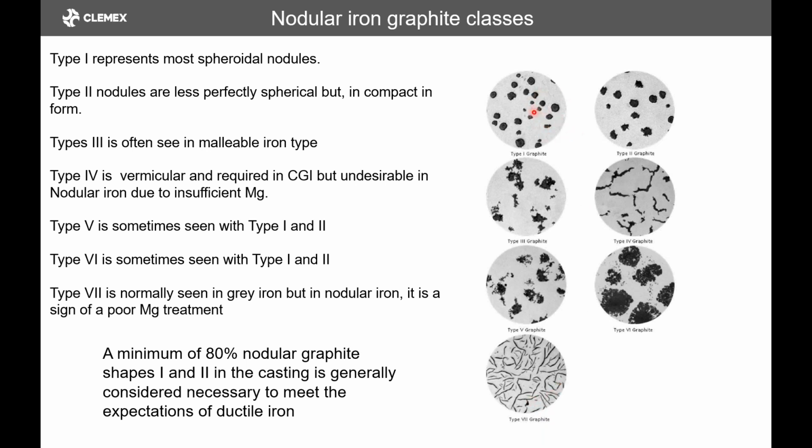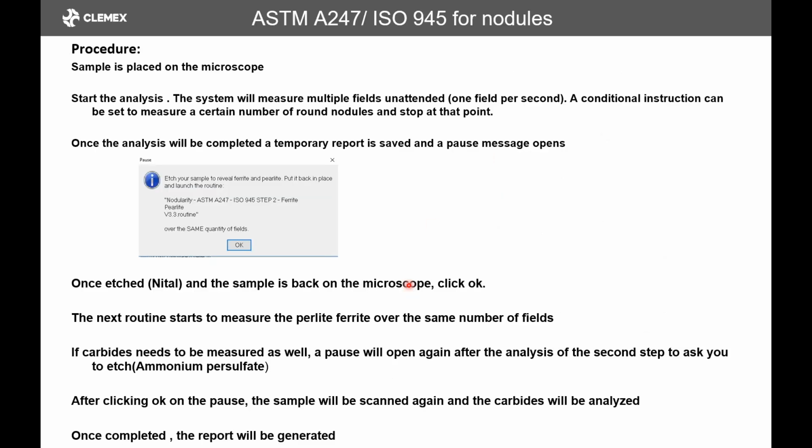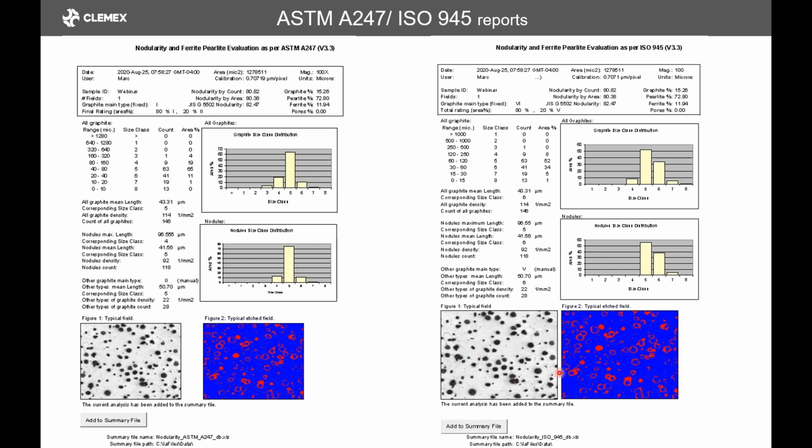So what they call 1 is 7, and what we call 7 is 1. So it's just inverted. Yeah, so the difference here again, and then there's also the class, which is a little different, like the class size, but overall it's the same principle.